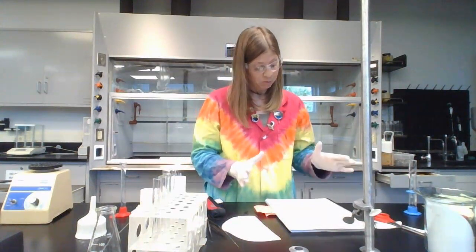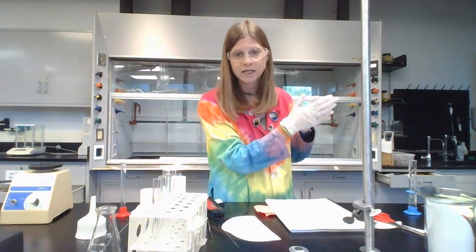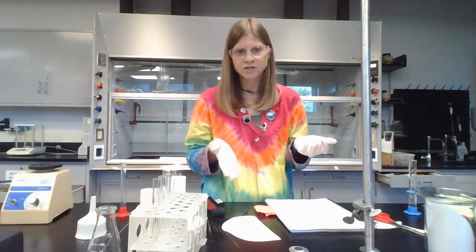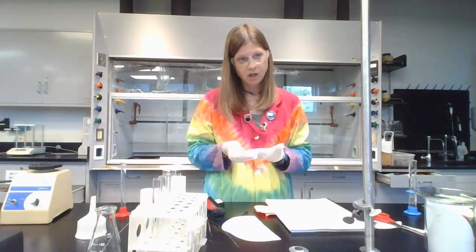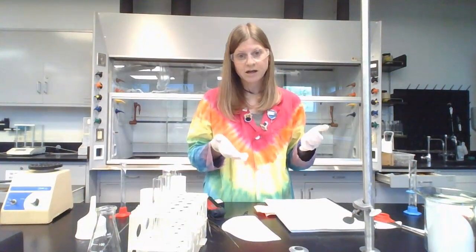At that point, hopefully, 30 minutes have happened, and you're ready to take your aspirin out of the oven. Because remember, that was like put it in the oven, and then we did this TLC plate thing. So let's say you're not done with the TLC plate, but it's been 30 minutes. Go get it. Okay, pause what you're doing and go get it. You need to take it out of the oven, and we've got gloves that you can use because the glassware is going to be hot. Set it down, let it cool to room temperature.